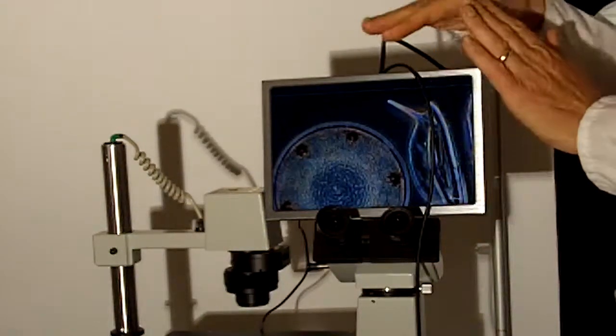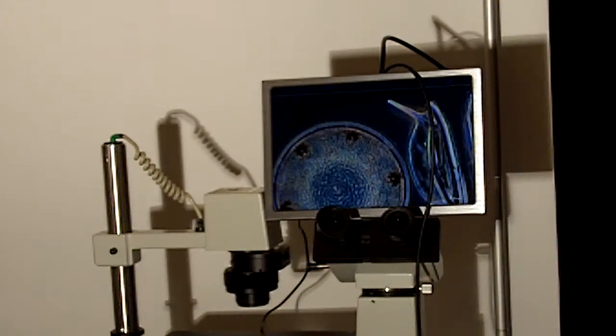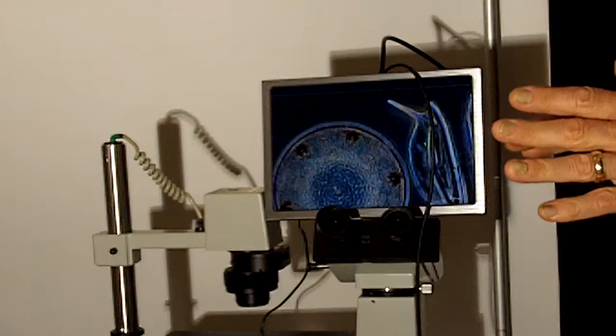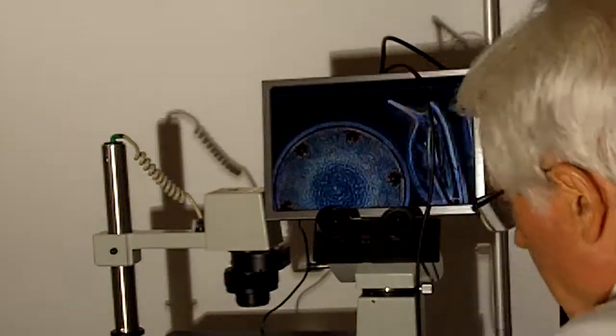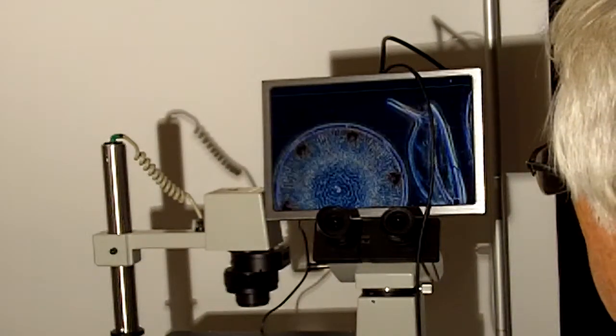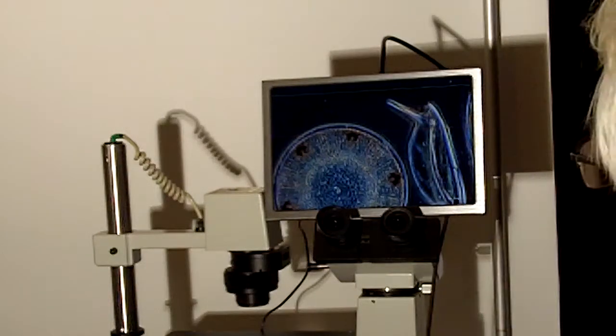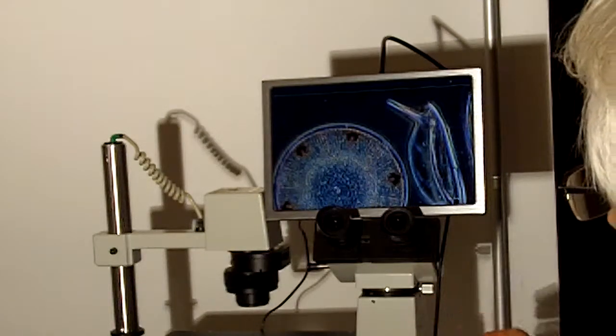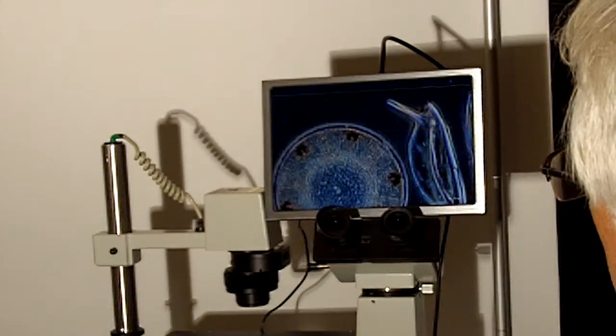This is the only display you can use. There's no output for big screens and no USB output for a computer. But here you can see the image quality. This is near HD image quality, roughly 1280 by 800, which is technically WXGA performance.